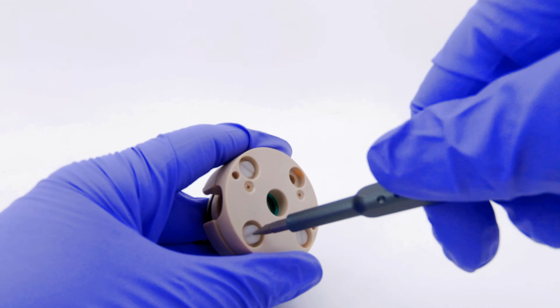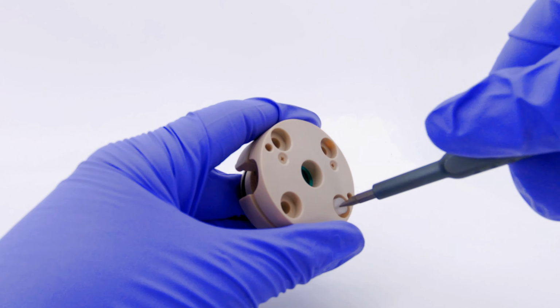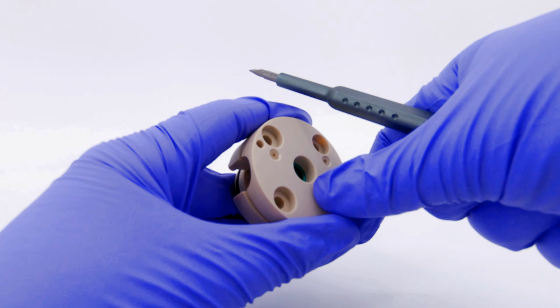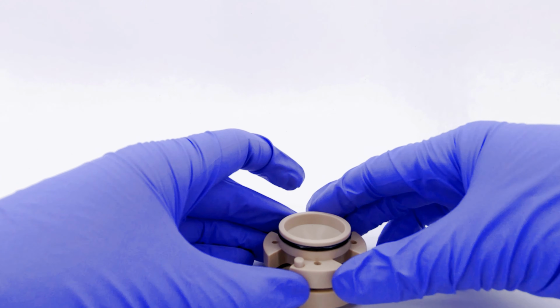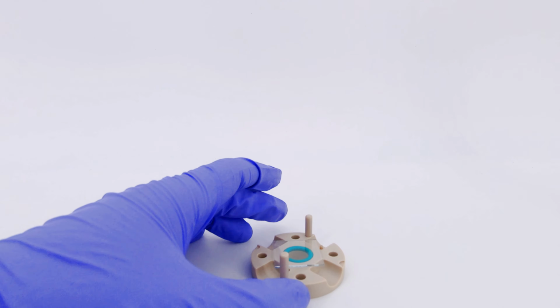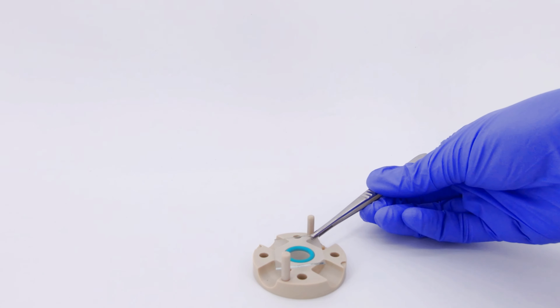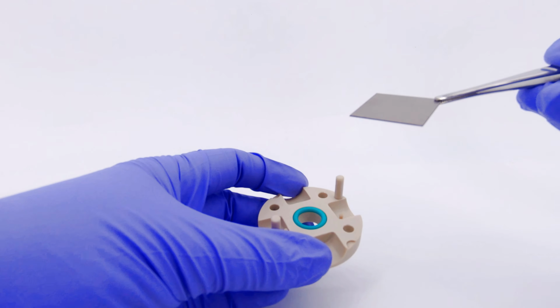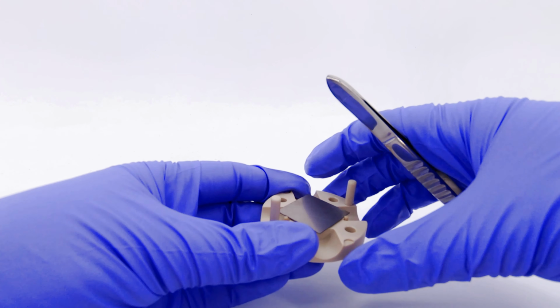Then, go ahead and unscrew all 4 nylon screws. Holding the two halves together, gently place them on a flat surface and lift the top half away. Now you're ready to insert your electrode. In our demonstration, we'll be using a piece of titanium plate. It's important to align the plate's edges with the screws to ensure that it is centered.